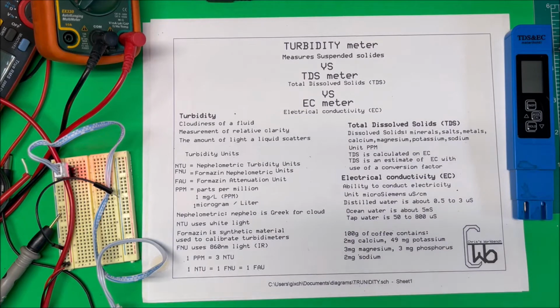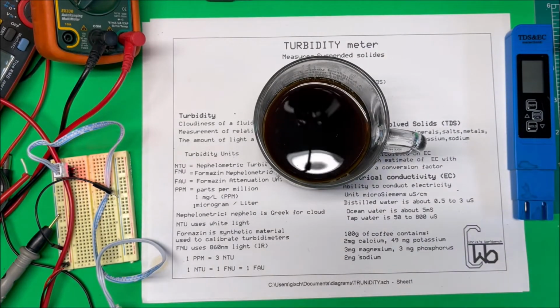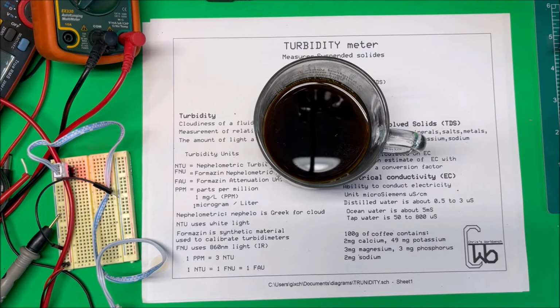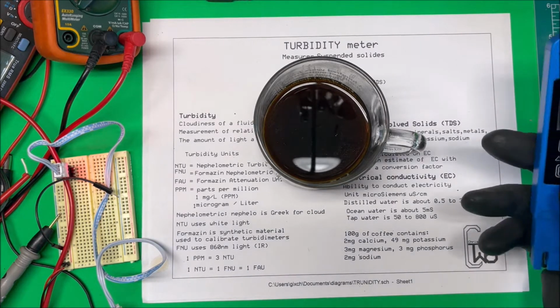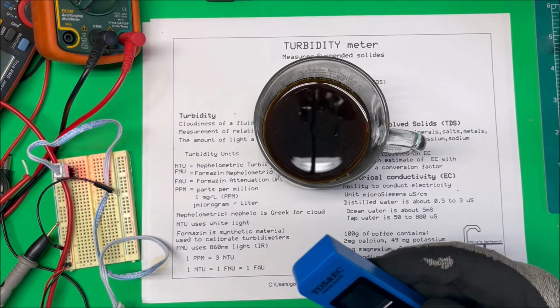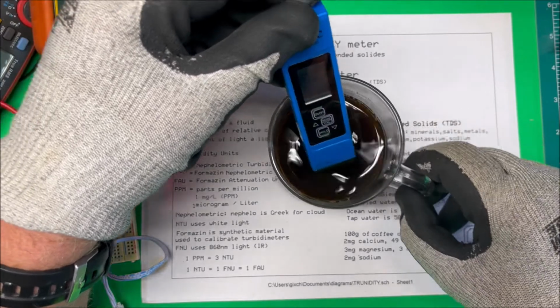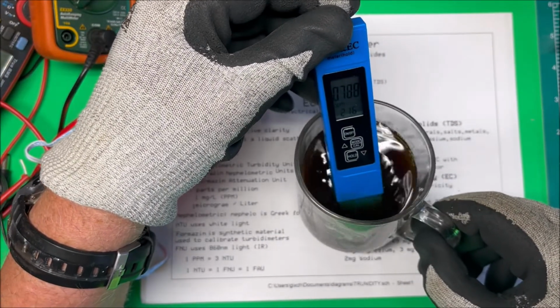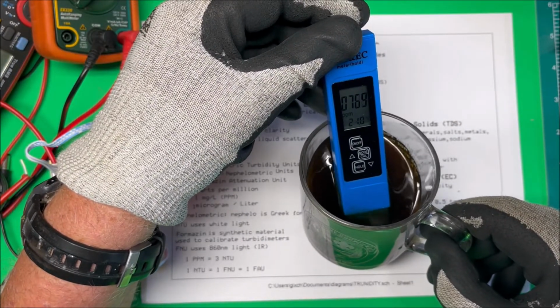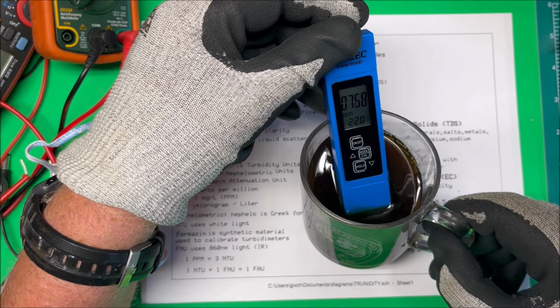Now, I'm going to test some coffee, and coffee contains calcium, potassium, magnesium, phosphorus, sodium. So on this meter here, I'll turn it on, and it's set for parts per million. So we'll see what it does here. I don't know if you can see that or not, but it's about 760 parts per million.